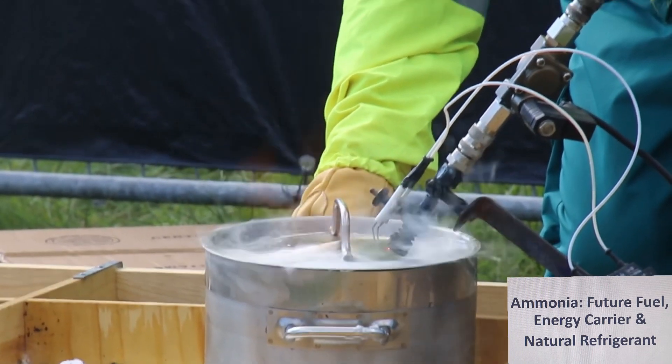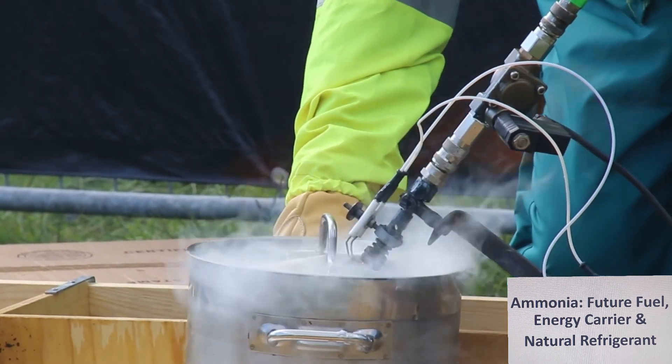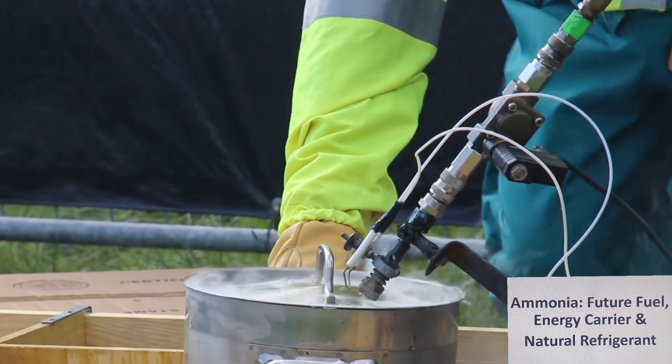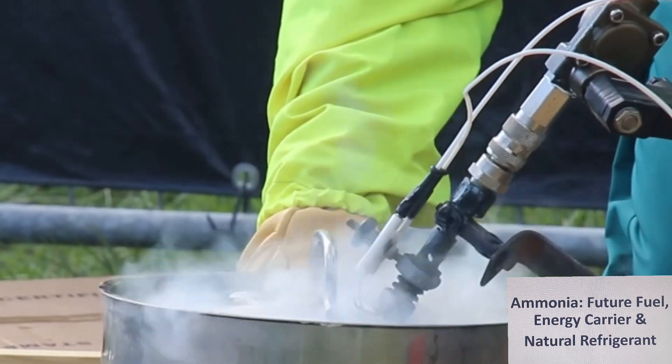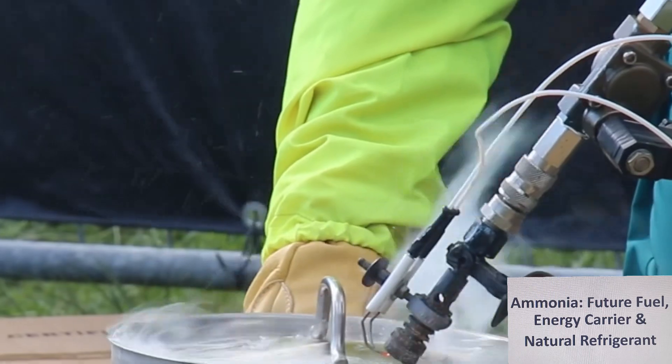Now you can see that the ammonia is burning with an orange-red flame. Ammonia needs a pilot flame for burning. As soon as the pilot flame is shut off, ammonia stops burning immediately as well.